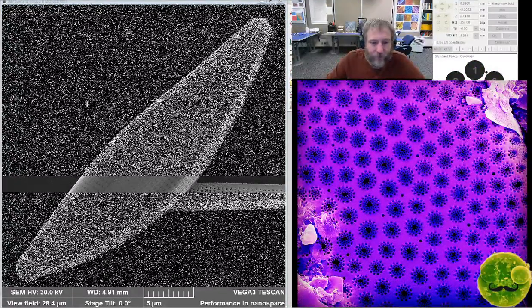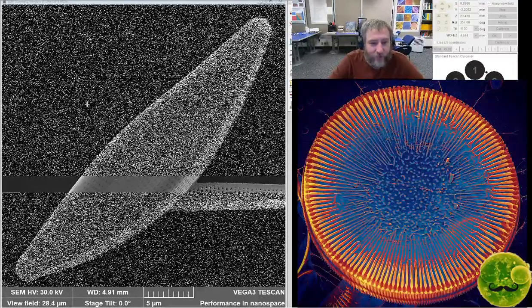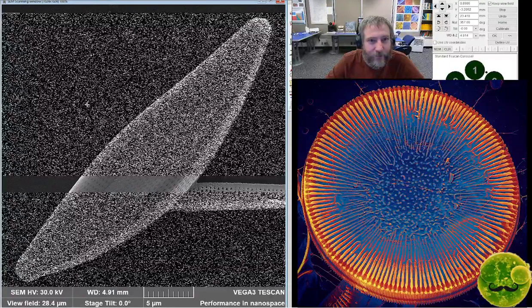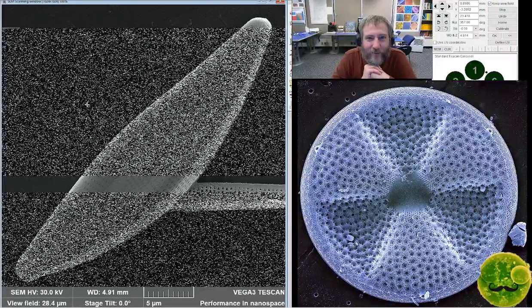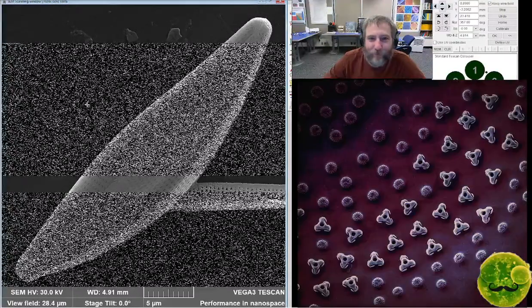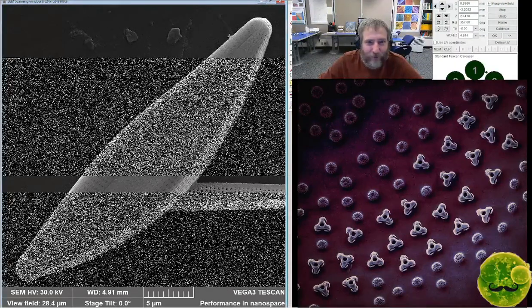This is one of the smaller Afrocymbella, and one that's already been described. It's named after Pat Kaselic, who's a friend and colleague of mine, who works on Gomphonema and describes several Gomphonema from all over the world. The Gompho monster, the weird diatom that we found in Idaho, is sitting in his lab somewhere waiting for him to make a decision about what we're supposed to do with it. I don't know if he's waiting for me to write a manuscript or what, but it's on the to-do list.